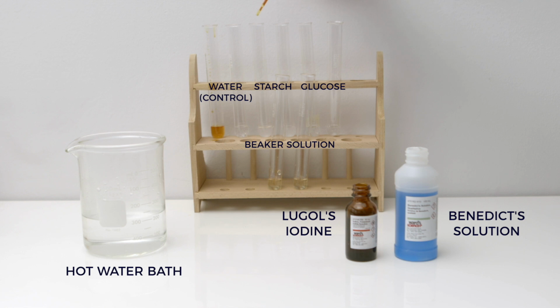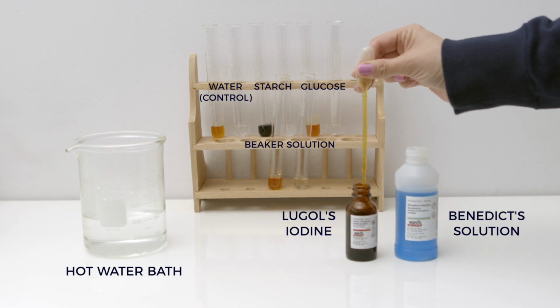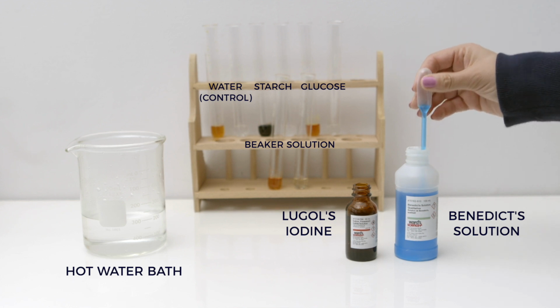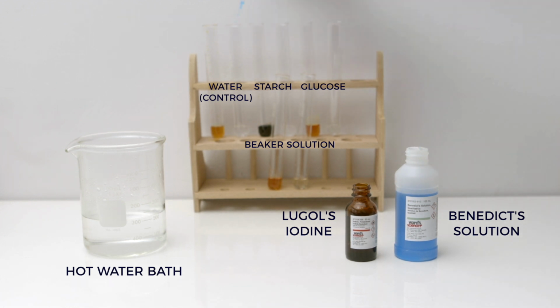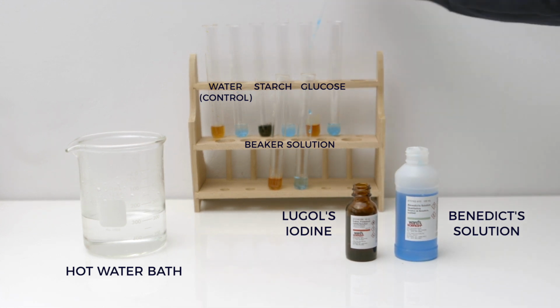Use Lugol's iodine solution and Benedict solution to test the samples in our test tubes. Lugol's iodine solution is a starch indicator, and it turns from amber to blue-black in the presence of starch. Benedict's solution is a glucose indicator, and it turns from light blue to orange only when it is heated and glucose is present. The 4 test tubes with the Benedict solution will be placed in the hot water bath in the beaker. Add the Benedict solution to the remaining 4 test tubes and place them into the hot water bath.